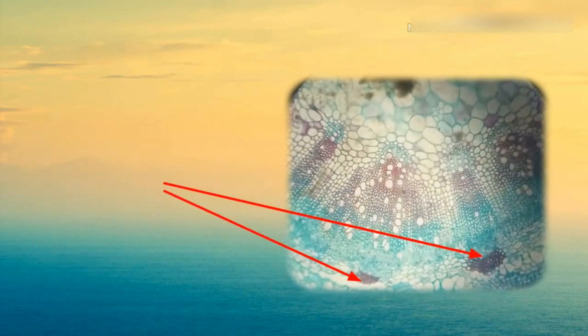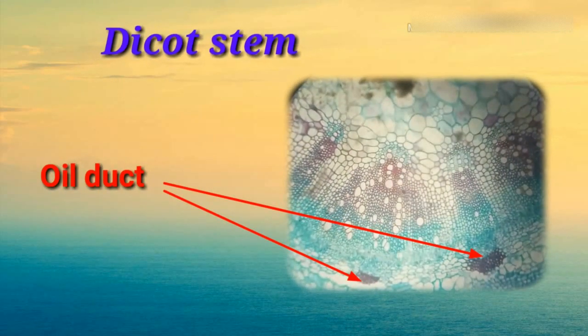Here is the oil duct, and this one is dicot stem. Remember, if there is an oil duct, most probably it is dicot stem.